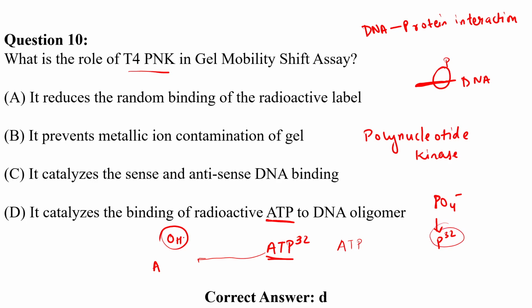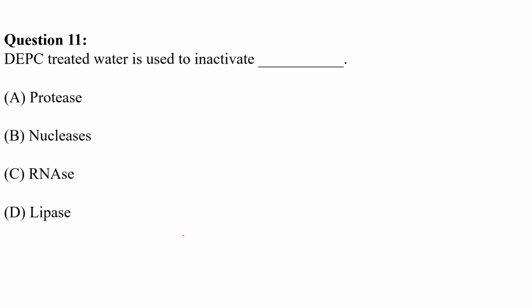Okay, moving to the next question. DEPC treated water is used to inactivate what? Option A, proteases. Option B, nucleases. Option C, RNases. Option D, lipase. So, DEPC treated water is used to inactivate what?